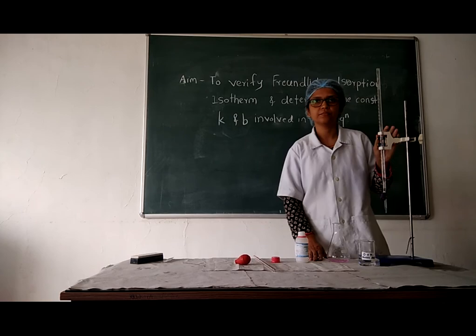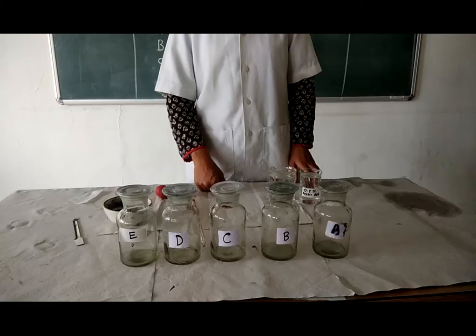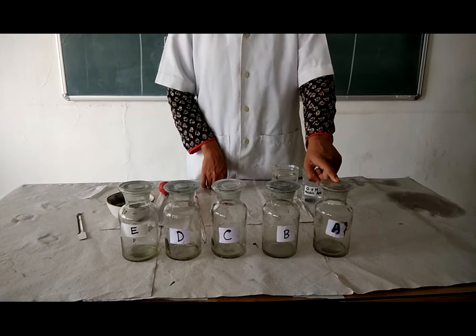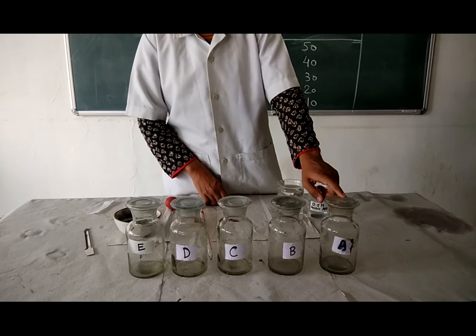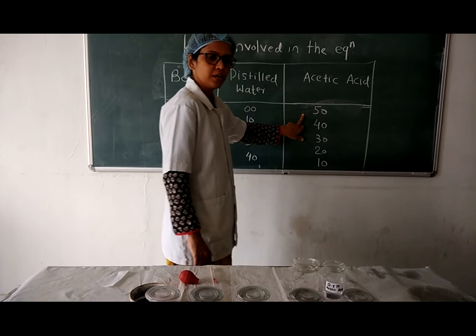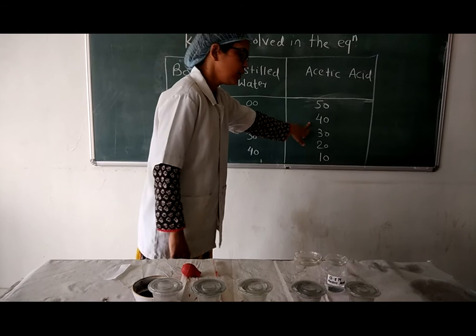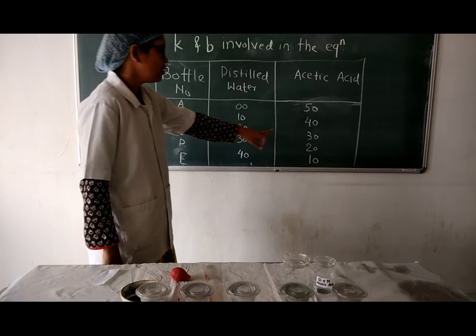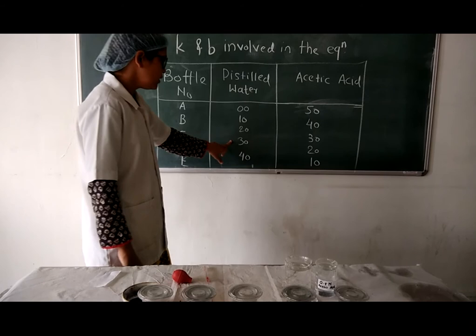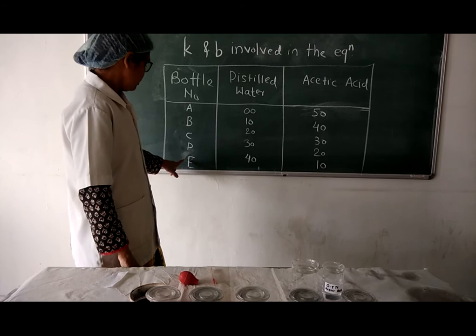Here I have taken 5 reagent bottles labeled A, B, C, D, and E. In reagent bottle A, I am adding 0 ml distilled water and 50 ml acetic acid. In bottle B, 10 ml distilled water and 40 ml acetic acid. In bottle C, 20 ml distilled water and 30 ml acetic acid. In bottle D, 30 ml distilled water and 20 ml acetic acid. In bottle E, 40 ml distilled water and 10 ml acetic acid.